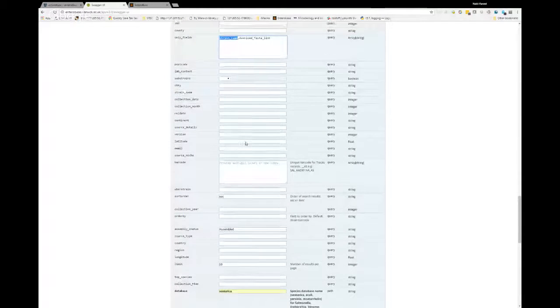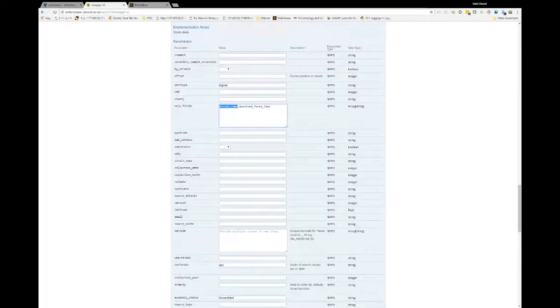Most of these metadata fields are pretty much metadata that you're putting back into it. I've tried to write little notes. Probably need to add a few more descriptors as well.